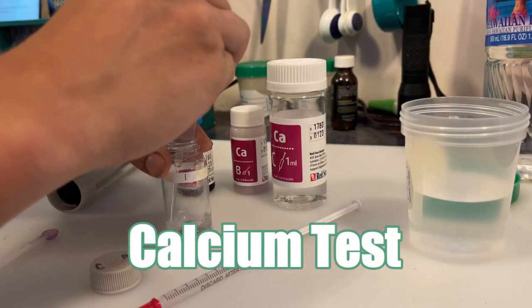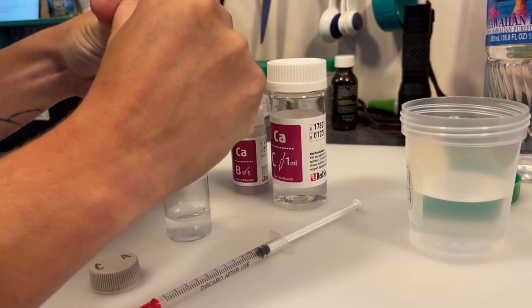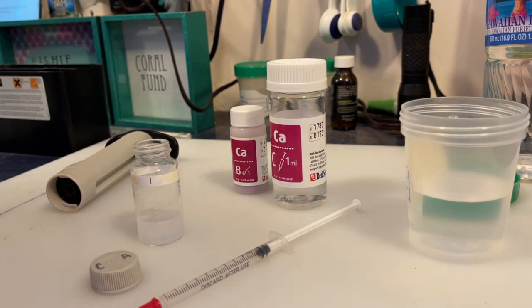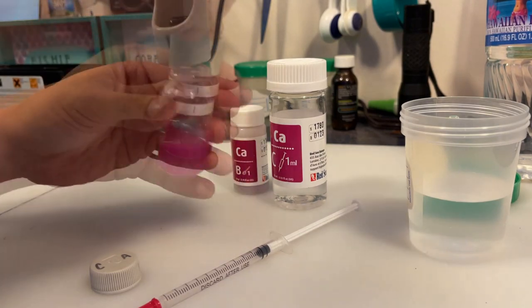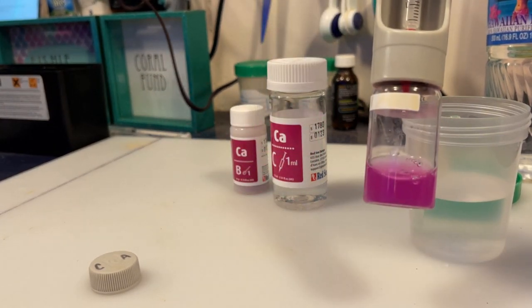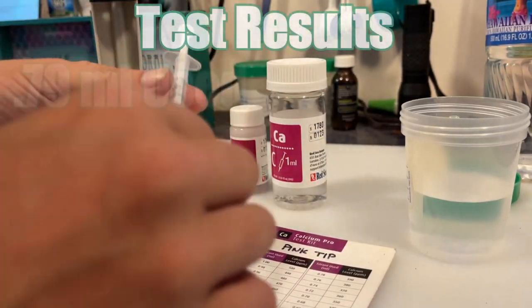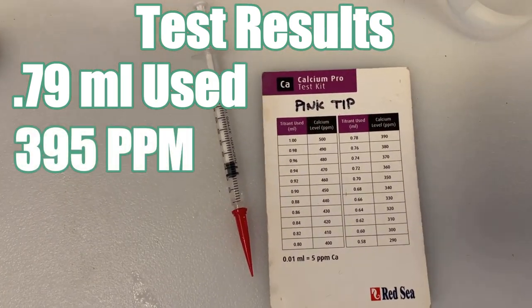Calcium is a building block for our corals, invertebrates, and coralline, and is vital to their success. We have always used the Red Sea Calcium Pro test kit and today is no different. Our corals depend on calcium to fall where it should be so their skeletons can continue to grow and flourish. This is another element that reefers have to add by either a calcium reactor like we are using, a two-part solution, or frequent water changes. The ocean is able to produce this naturally. Calcium is recorded to have an average of 412.1 in the Pacific Ocean. We had 0.79 milliliters of reagent used in the syringe after the color change and by using Red Sea's chart, we are left with 395. That ends up being a little lower than the average. Without calcium, our reefs at home, as well as the reefs in the ocean, would not be able to continue growing.